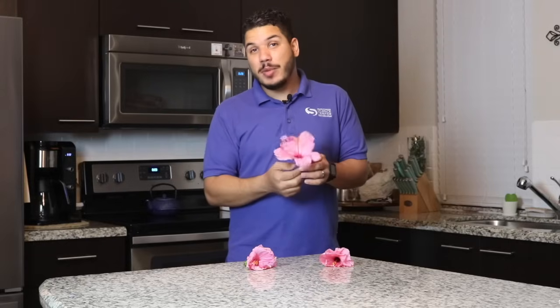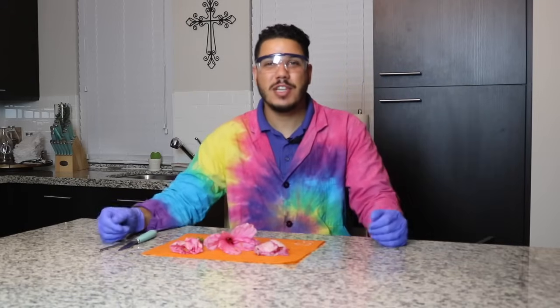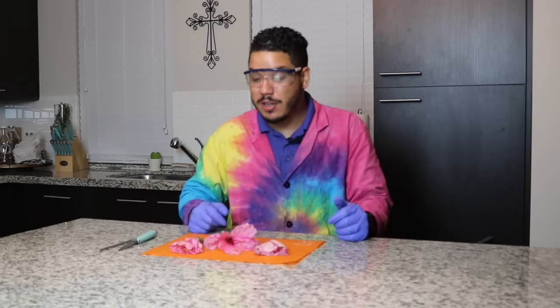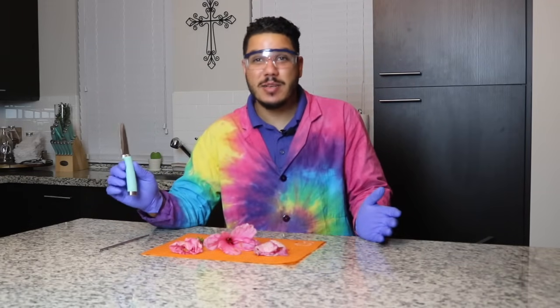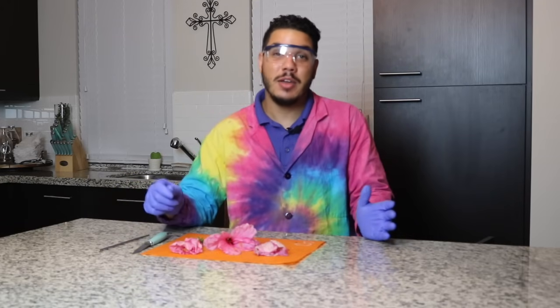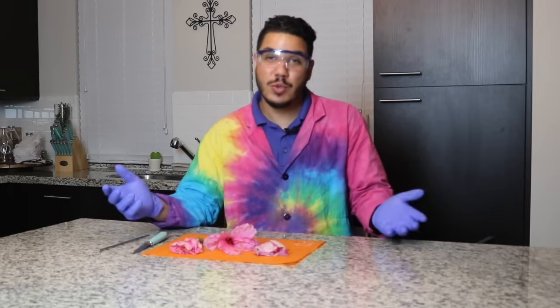In this case, we're going to be dissecting hibiscus flowers. Safety first — I've got my gloves on just in case I'm allergic to anything in these flowers, and I've got my goggles on. We're going to need a cutting tool. I'm just using a simple paring knife. If you are doing this with little ones at home, feel free to use a butter knife — that's actually what we use at the Science Center when we do this as a class. We use plastic butter knives, which work just as well.